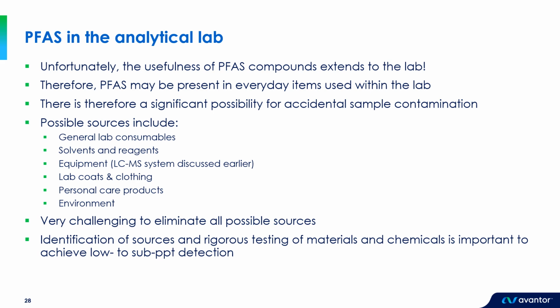PFAS, of course, have been used over the years in clothing, and lab coats and clothing that we wear into the lab are no exception to that. Of course, our lab coats, we want to be fairly flame retardant, so potentially PFAS containing substances have been used in their manufacture. Personal care products that we wear and bring into the lab, of course, can also lead to a degree of contamination, and environmental factors as well. So the air supply, potentially filters in air conditioning units can also contribute to the lab environment.